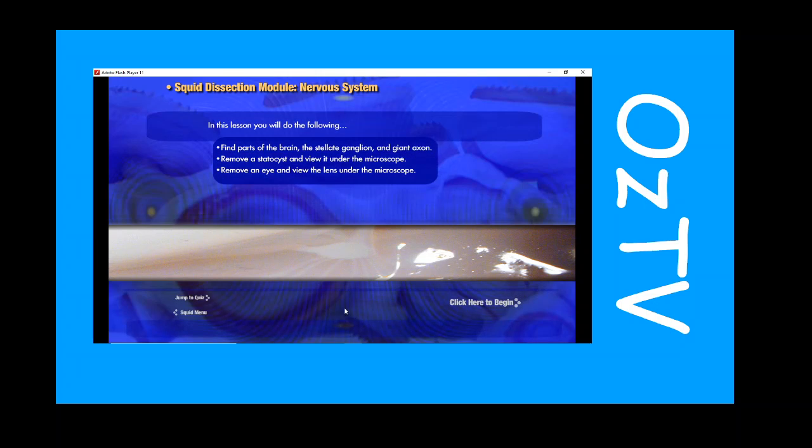In this lesson you will do the following: find parts of the brain, the stellate ganglion, and giant axon; remove a statocyst and view it under the microscope; remove an eye and view the lens under the microscope.